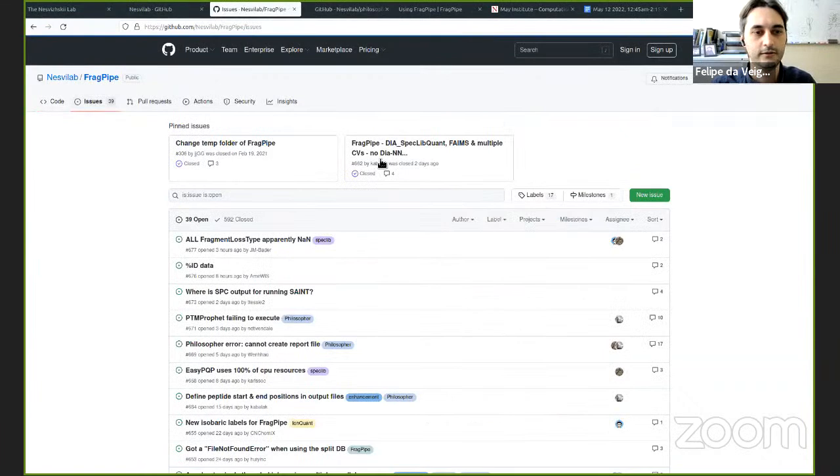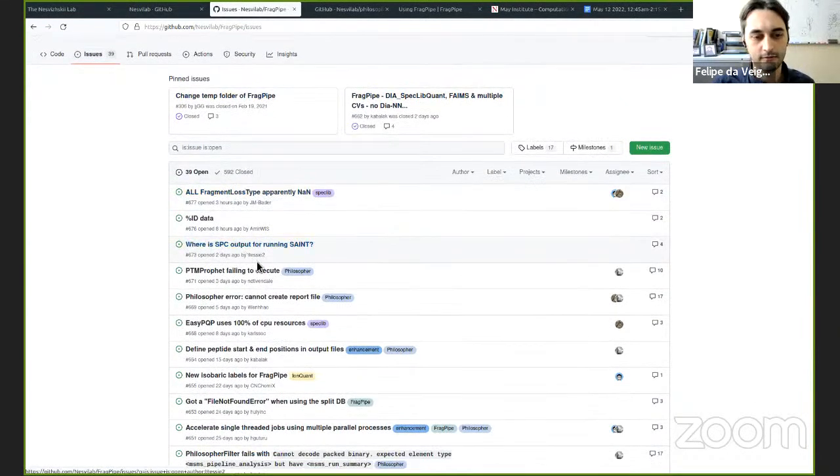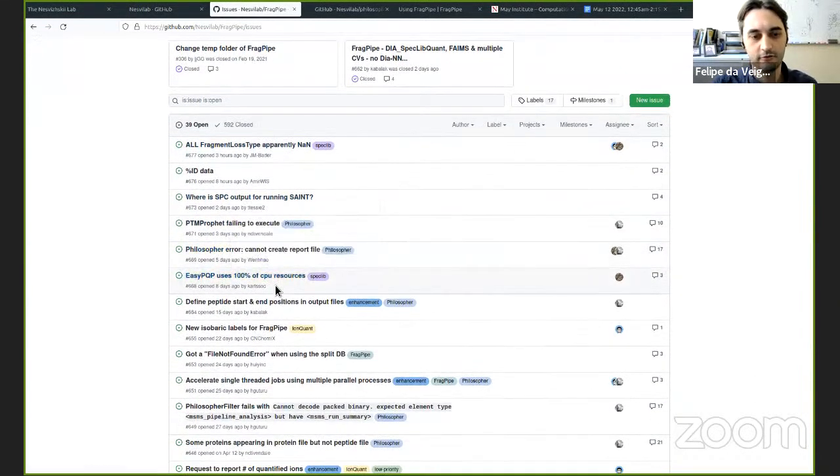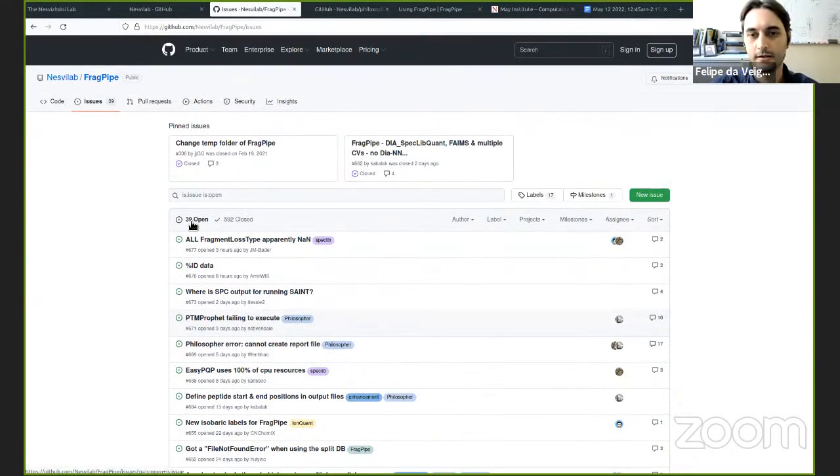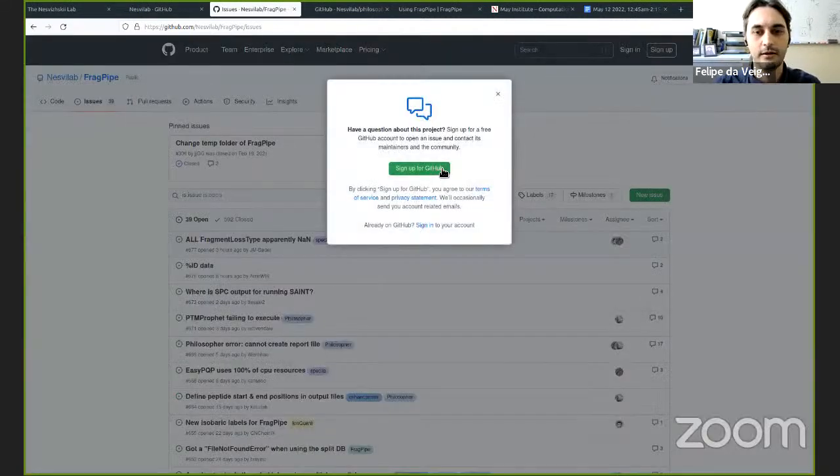If you click here, you can see every discussion that we're having right now, some open issues and things like that. And if you want to report a problem or ask for help or just get in touch regarding something in particular, you can click on this green button here called New Issue.